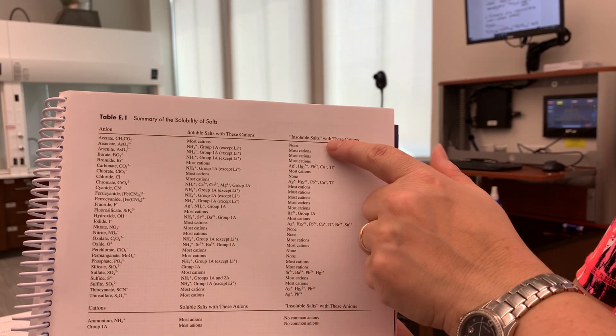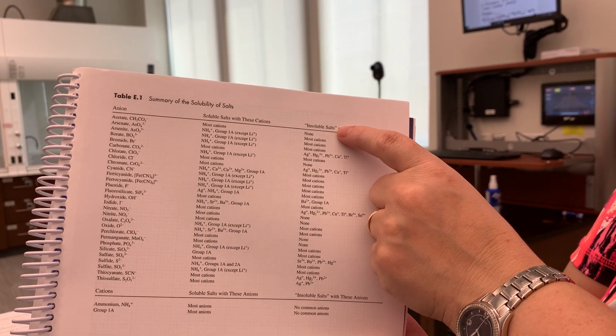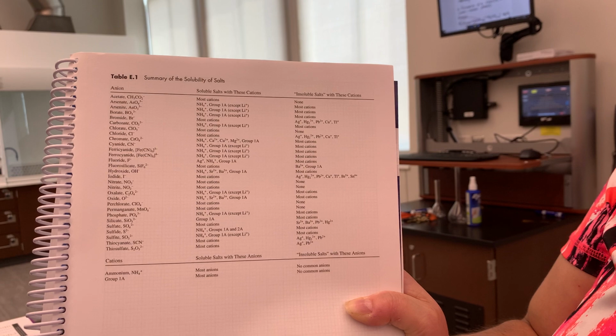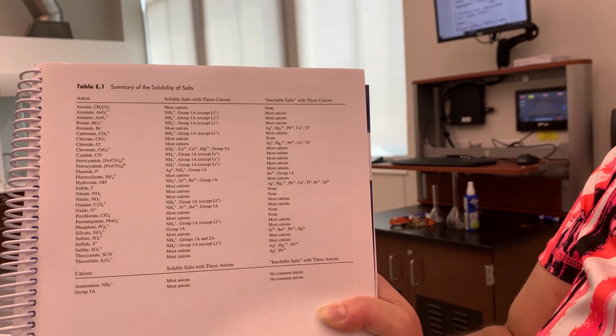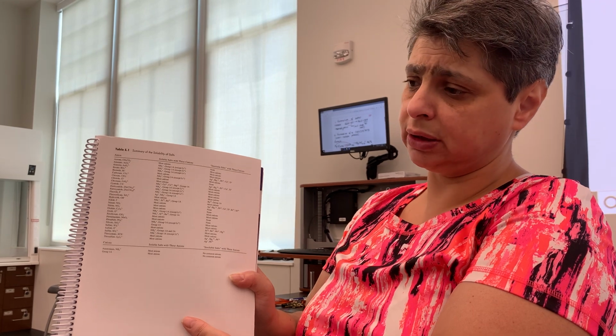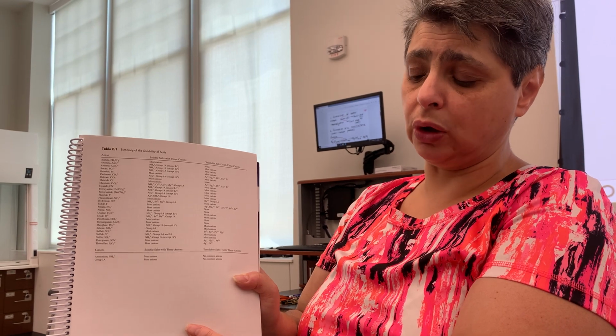I would point out here that insoluble is shown in quotes. It's not a coincidence and it's not a minor detail. This is because in nature there are no truly insoluble materials in water. Everything to a degree is soluble in water, but some things have extremely low solubility, and so they appear as though they are insoluble, and those would be the ones that produce a precipitate. We will discuss use of this table in class. Hopefully your TAs will be able to explain a little more, but I would strongly encourage you to take a look at this and figure out how this table should be used for lab.